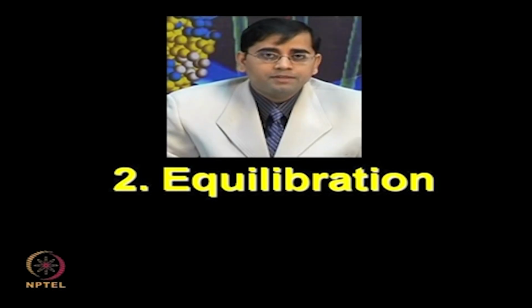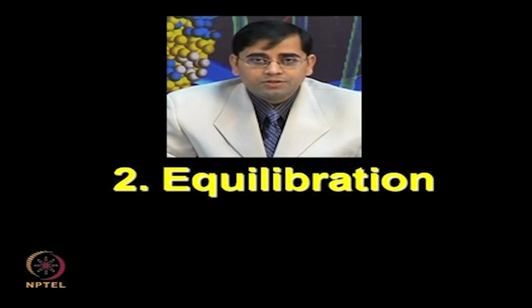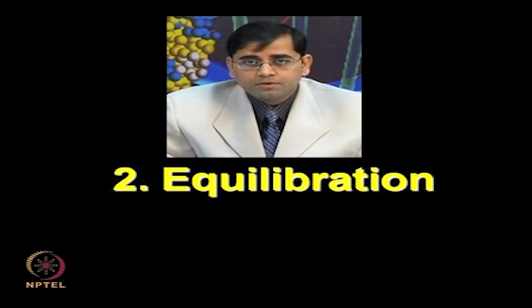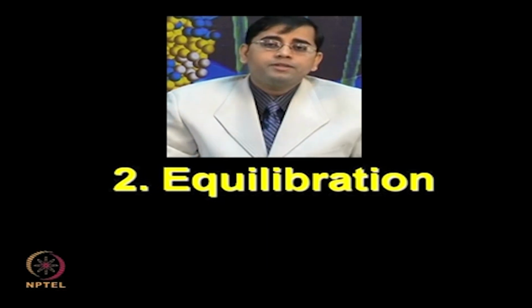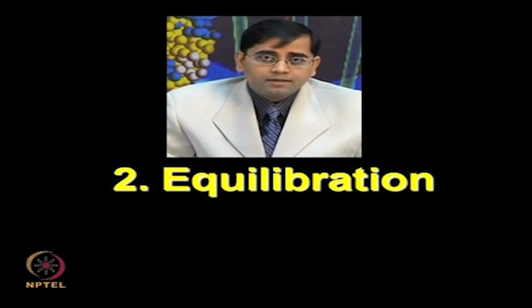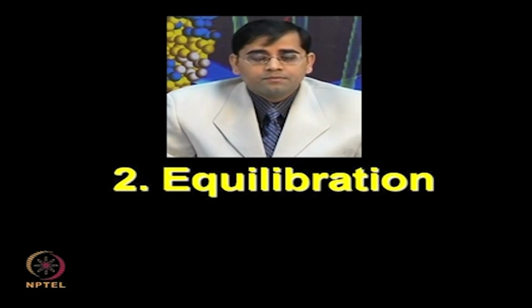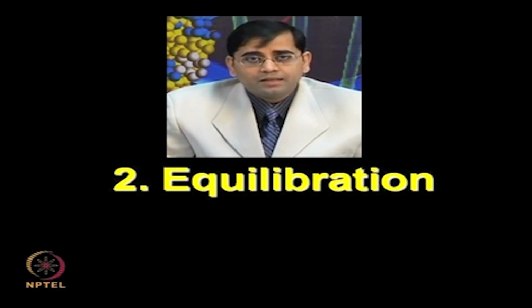As I briefly described in the previous lecture, once you have performed the isoelectric focusing, or IEF, you need to prepare your IPG strip for the next step, which is SDS-PAGE. When you are doing conventional SDS-PAGE, you pour the gel, both resolving and stacking, then make wells by using a comb, and then you load your protein samples in different wells.